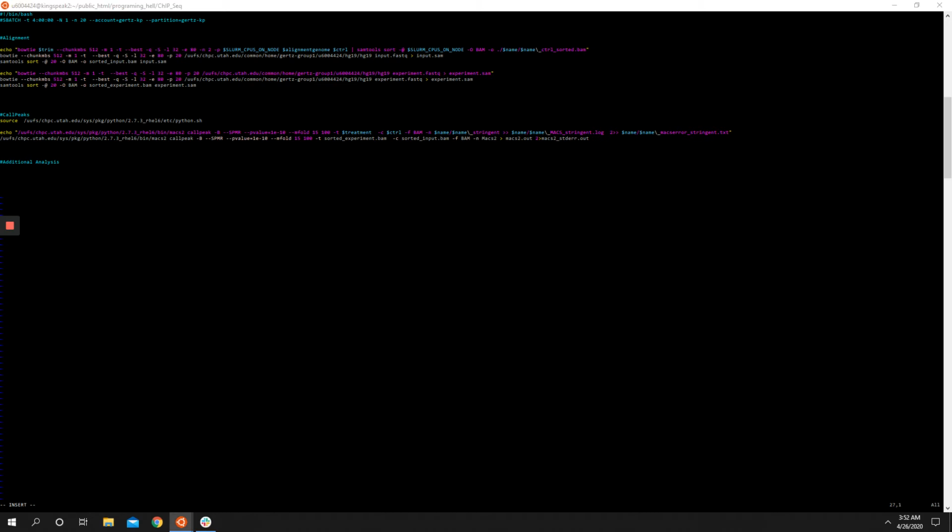Why are you not copying? Let's see here. This thing's being kind of ornery. This is kind of strange. I may have to type this whole thing out. Okay, here we go.